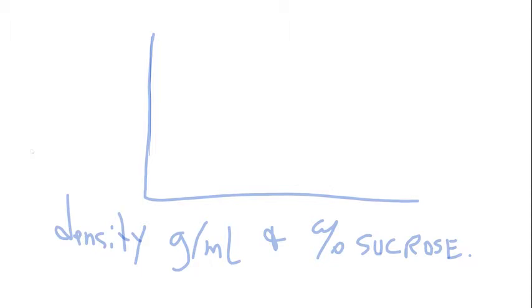Wouldn't you compare it to like when it was? Never mind. I'm thinking of something totally weird and different. Yeah. No. I was just thinking that you are going to compare it to something. What are you going to compare it to? Water, like of it just being water, I guess. But then that wouldn't work because you got it as a beverage already, so it's already mixed.